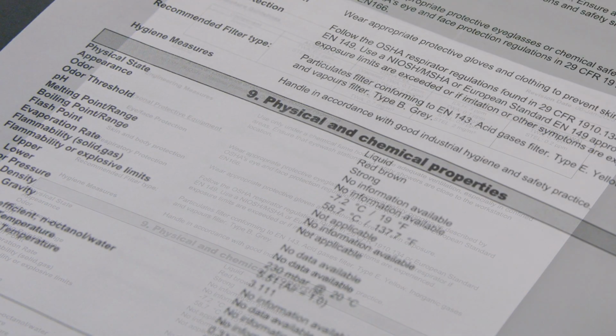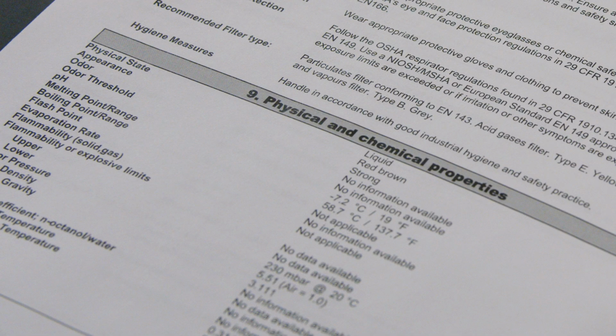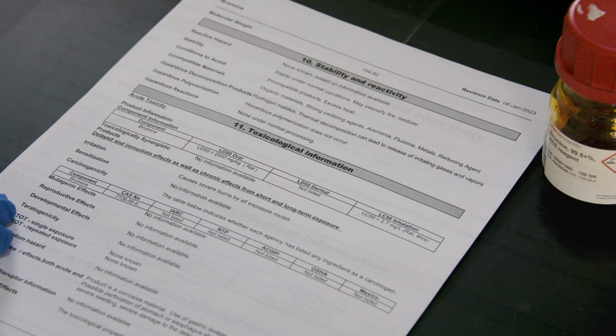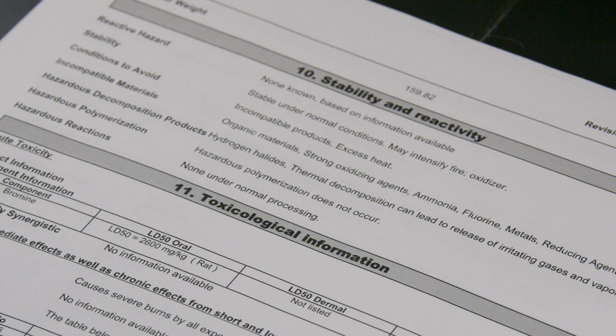Section 9 dives into physical and chemical properties. It provides information about the chemical's appearance, odor, solubility, and more. Section 10, Stability and reactivity, informs you about how the chemical might react when exposed to other substances or conditions. It helps you prevent dangerous reactions.